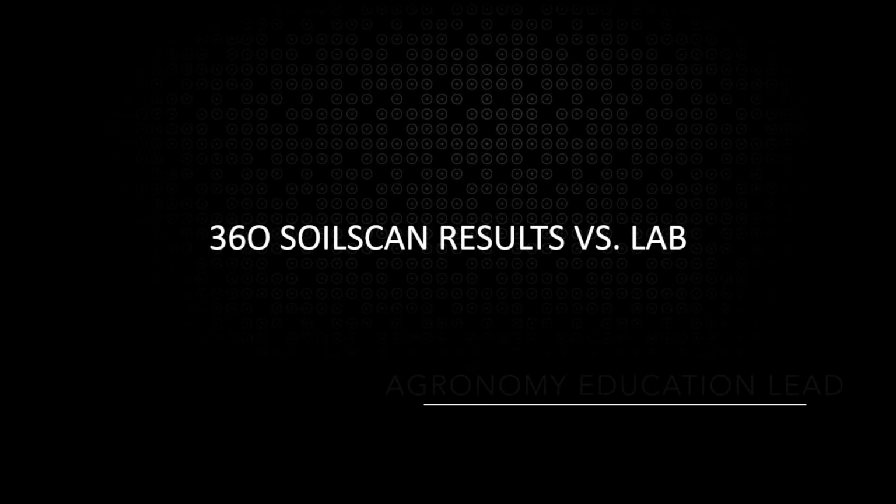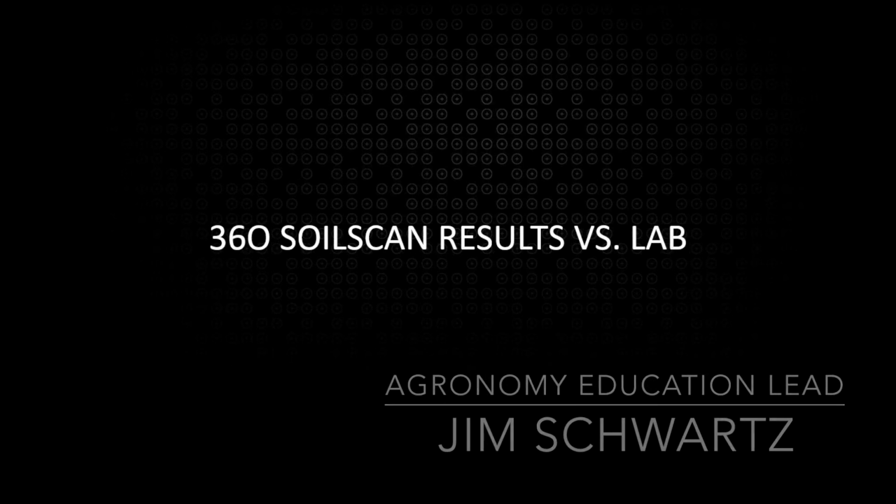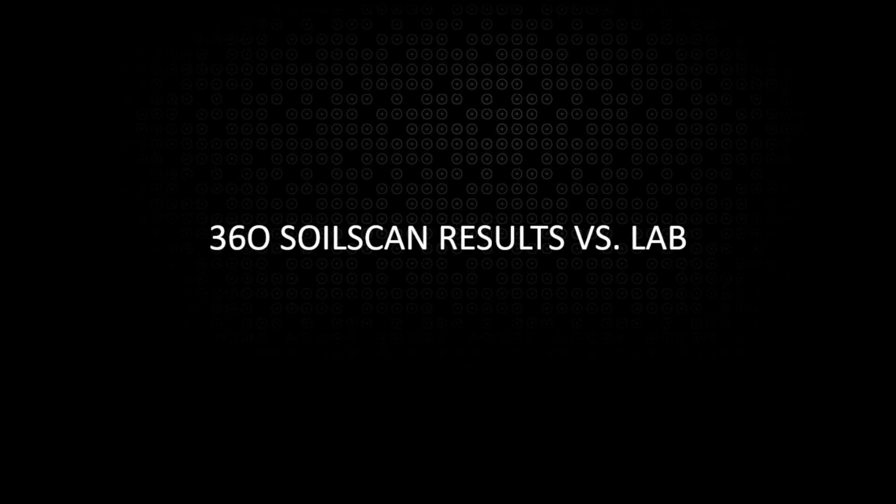So I want to spend a little bit of time this morning talking about this time of year as folks start running their 360 SOILSCAN machines, and sometimes they'll send parallel samples off and go, gosh, the results are different. What's going on? Why am I seeing what I'm seeing? Does that mean somebody's right and somebody's wrong?